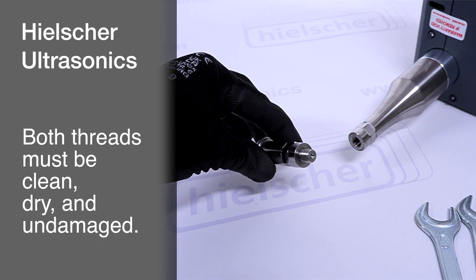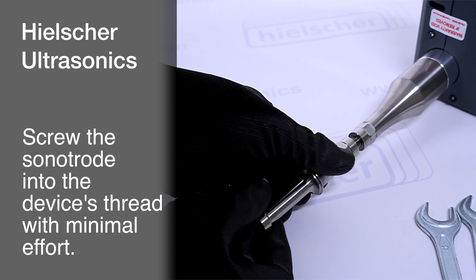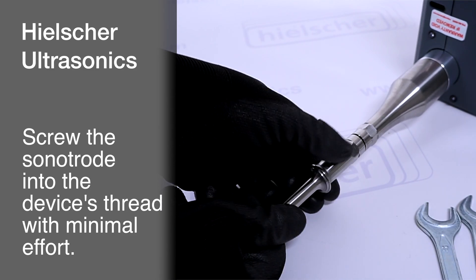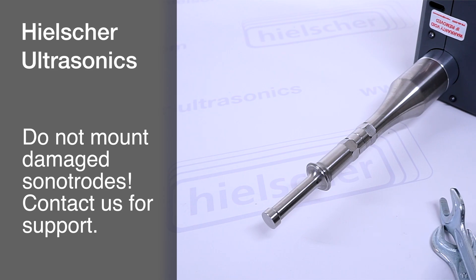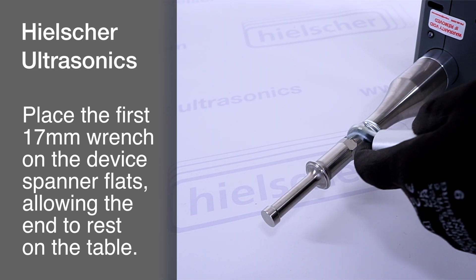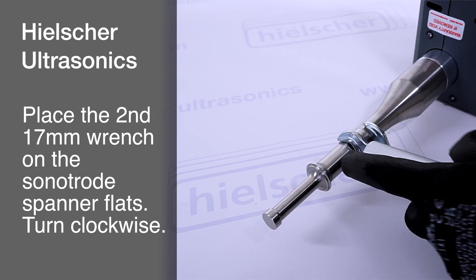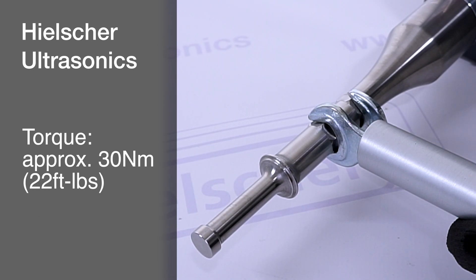Before installing a new sonitrode, ensure that both the external thread on the sonitrode and the internal thread on the device are clean, dry, and undamaged. Screw the sonitrode's thread into the device's thread, ensuring proper alignment. The sonitrode should rotate smoothly with minimal effort. If a thread is damaged, do not proceed with installation — contact us to resolve any issues. To securely fasten the sonitrode to the device, rotate it clockwise. Position the first 17-millimeter wrench on the device's hex spanner flats with the end resting on the table. Use the second 17-millimeter wrench with the extension to tighten the sonitrode clockwise. Ensure that tips of thin sonitrodes do not contact the table. The torque is approximately 30 newton-meter or 22 foot-pounds.